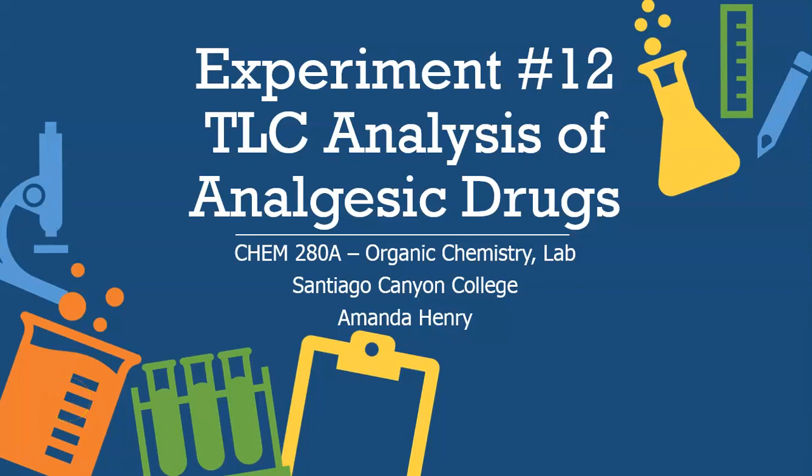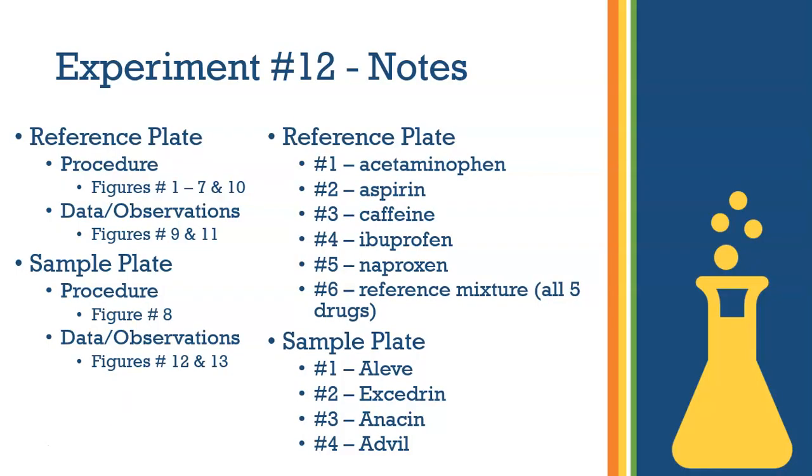This video will cover experiment number 12, the TLC analysis of analgesic drugs. It will go through the procedure as well as data and observations. A reference plate and sample plate were each made and analyzed.